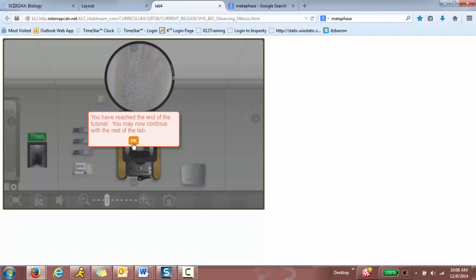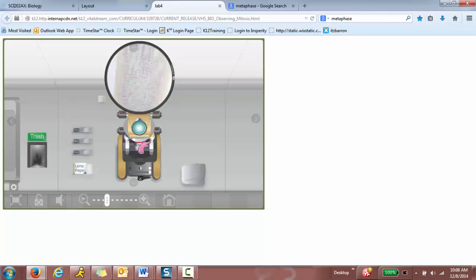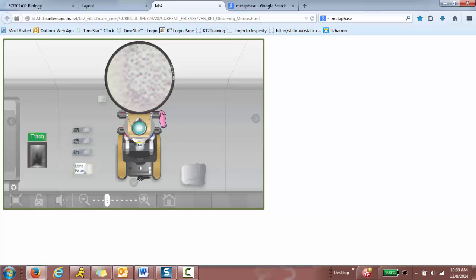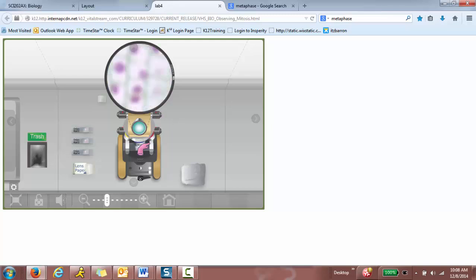You may now continue with the rest of the lab. And then you're going to go to a higher objective lens and scroll, click and scroll a little bit. There it is right there. And one more. So basically what I'm trying to, maybe I should do the fine adjustment knob right there.